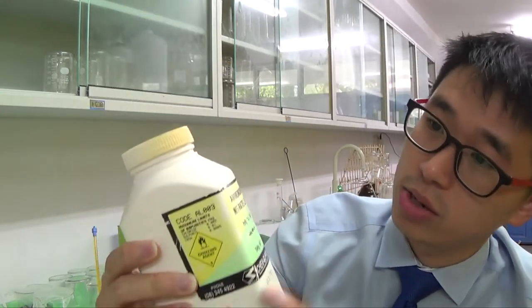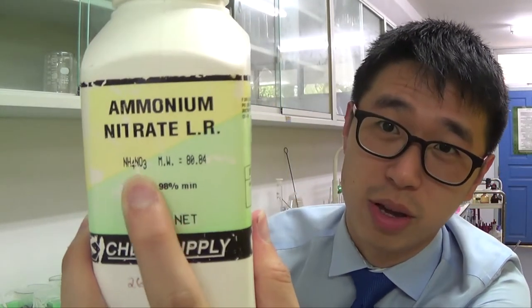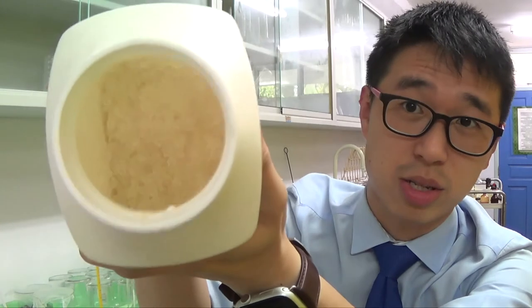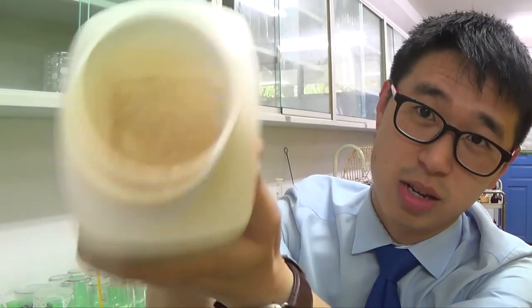This is an example of a solid called ammonium nitrate — NH₄⁺ and NO₃⁻. If you look inside, it's a crystalline white solid. As you'd expect from a substance with a giant ionic structure, it is a pretty crystalline solid.